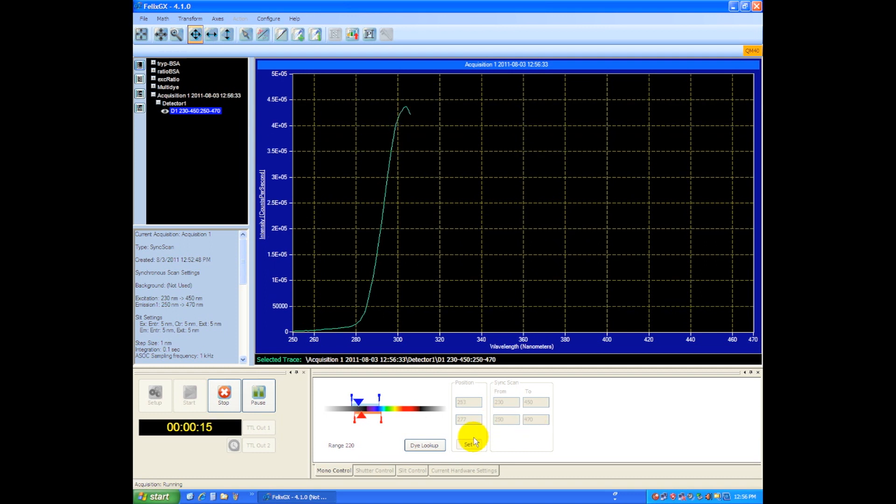So this first peak we see here is usually related to an absorption. As we excite around 290 there's a change in the intensity of the sample, so we see that here as an increase in the fluorescence emission of the sample.